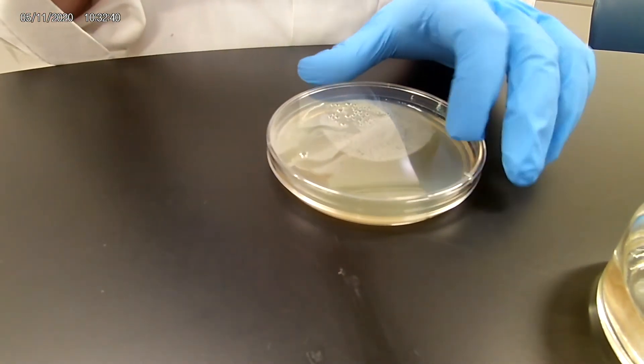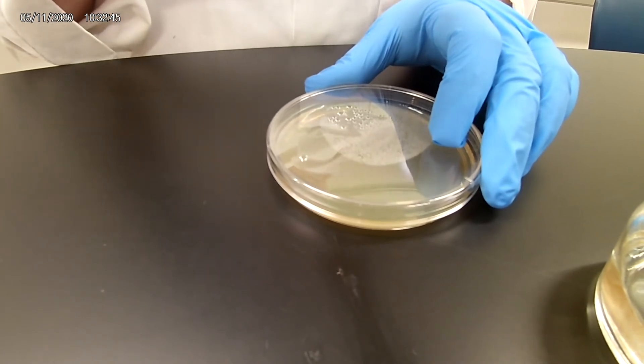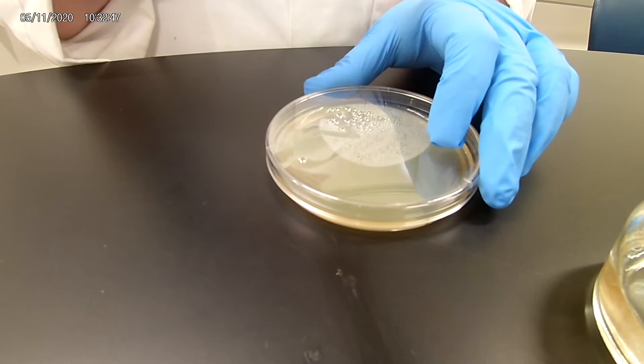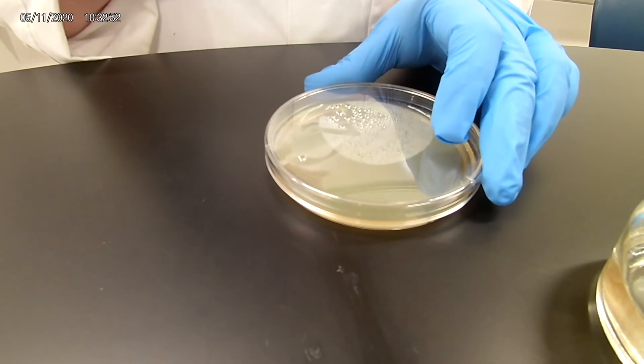And then last but not least, go into the fourth quadrant. So some people prefer doing this way where they have the four quadrants. And the idea is that by the time you're in the fourth quadrant, you should have individual separate colonies.